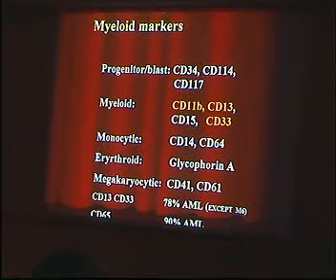So the person who is doing the immunophenotyping has to be told by the referring hematologist what he or she is suspecting on the bone marrow. Also, the person who is doing the immunophenotyping should see the slide, because in order to gate the cells, you should know what the morphology of the cell is, what is the size of the cell, so that they know which population of cells to gate. So whoever does immunophenotyping has to see the slide, and then they decide how to gate the population and find out what it is. Okay? And also by looking at the slide, we can know whether we need to add 14 and 15 as additional markers. Otherwise, this will cost more, and therefore many people may not want to do it.